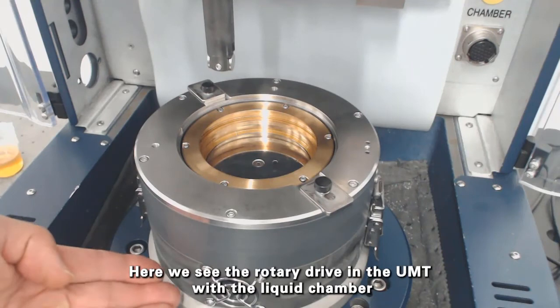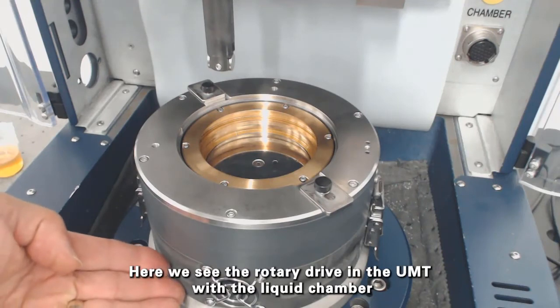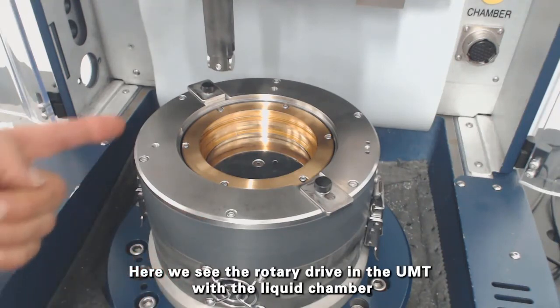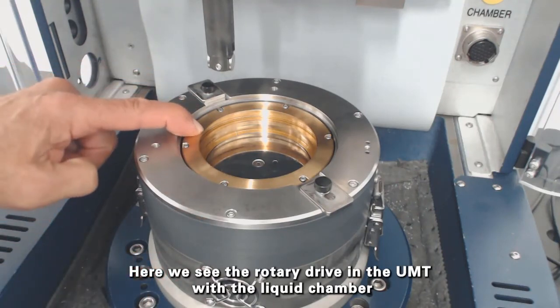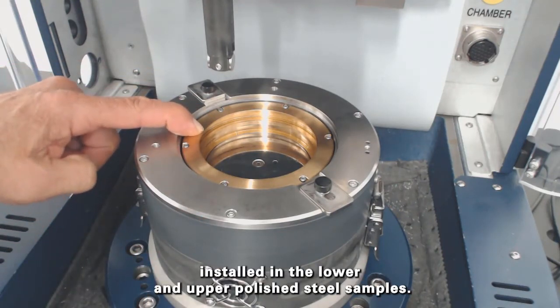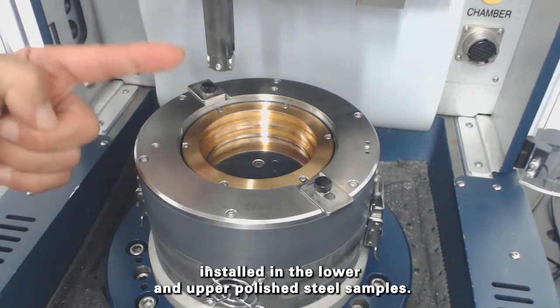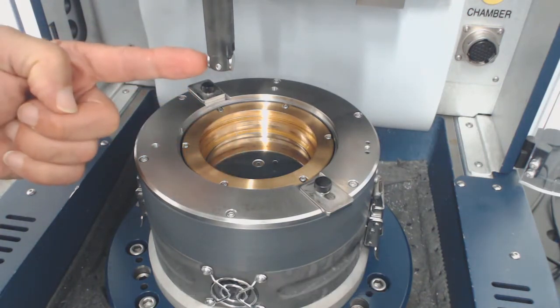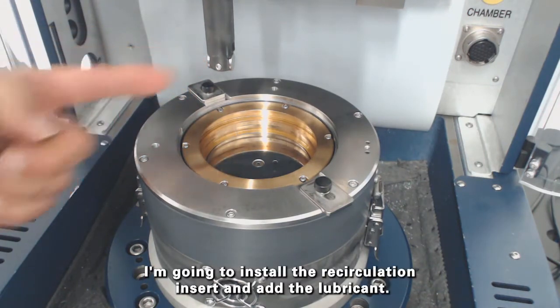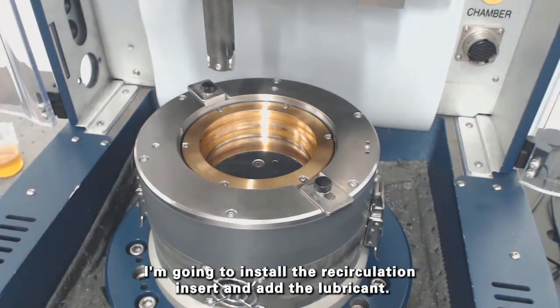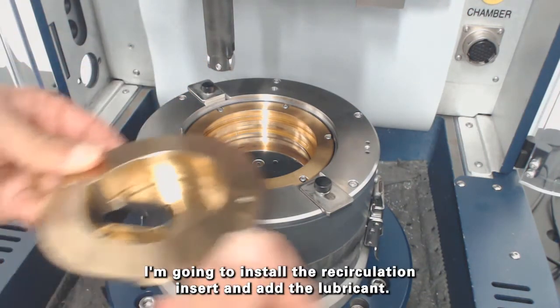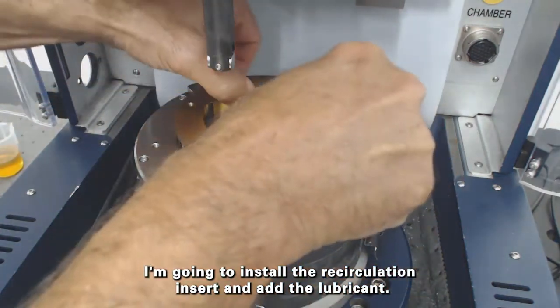Here we see the rotary drive in the UMT with the liquid chamber installed in the lower and upper polished steel samples. I'm going to install the recirculation insert and add the lubricant.